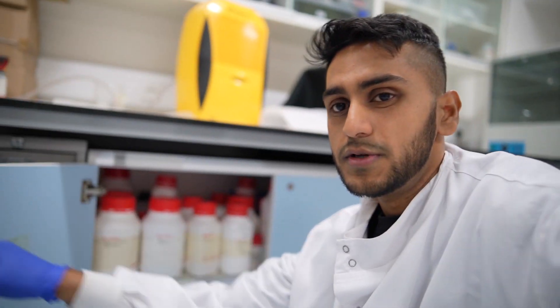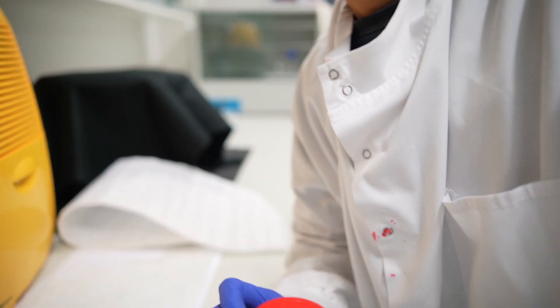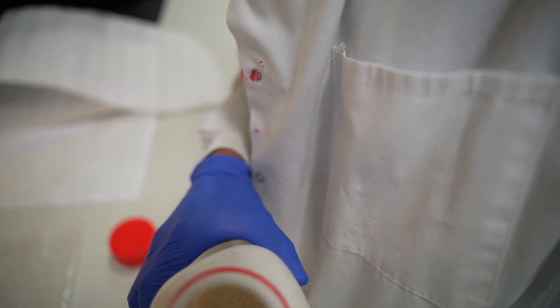So what we do in this lab is produce fibres from polymers. I'll just show you — we have a polymer cabinet here with lots and lots of different polymers that we can choose. Once we choose a polymer, we must dissolve it into a solvent and that will make a polymer solution. Right now I have calcium chloride — I don't even think that's a polymer. Calcium chloride is a salt, but the polymers usually come like this: they are either pellets or powders.